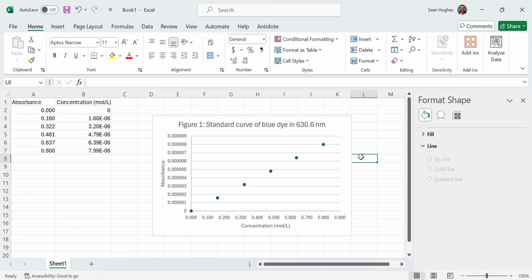The next thing we want to do is actually analyze this data to see if it's any good. Unlike a titration, where you're expecting the same result every time, like in the third lab where you titrated a hydrochloric acid solution with sodium hydroxide and expected hopefully the same volume of base every time to neutralize that acid, when you're looking at a tendency or a trend, there's a different way of analyzing precision. And remember, precision is how reproducible your data is.